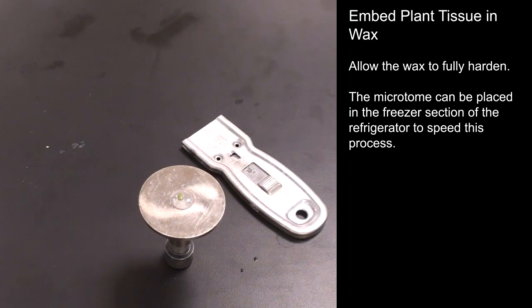Allow the wax to fully harden. The microtome can be placed in the freezer section of the refrigerator to speed this process.